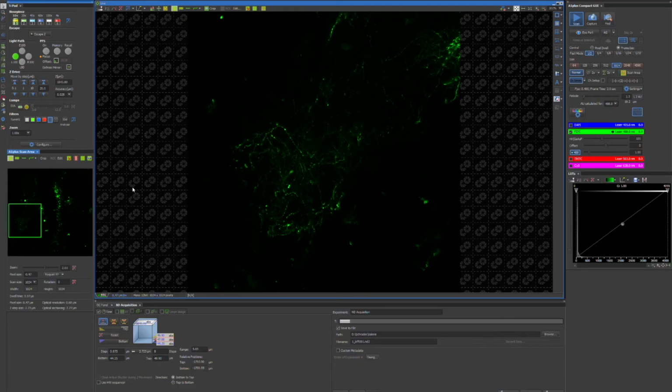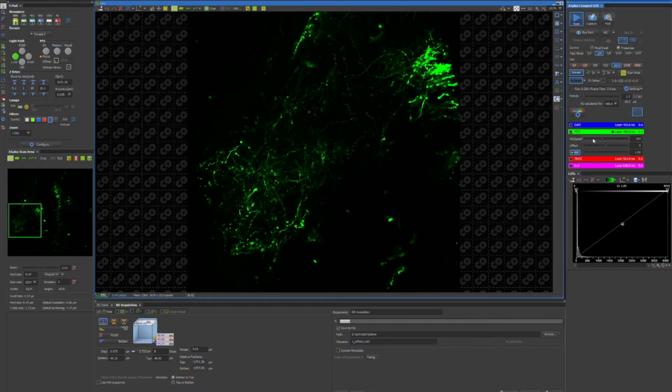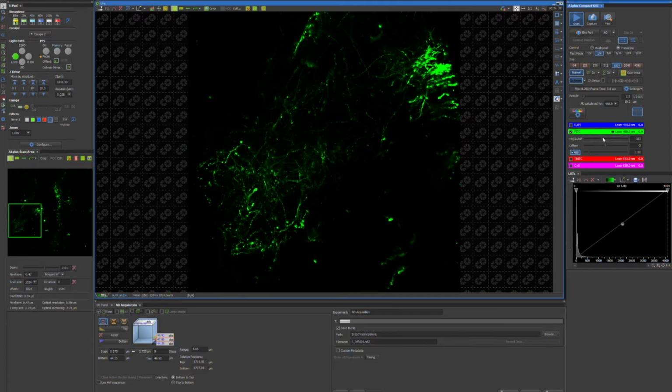Looking at that same region using a Nikon acquisition software attached to a confocal microscope, I was actually pleased with how this looks. The dye didn't diffuse along any axons, but seeing as I only let it sit for 6 hours, this is pretty good, and you can see it diffuse across some of the dendrites. I imagine letting it sit for a little longer could make some really pretty pictures, so I was excited to try out this procedure again.